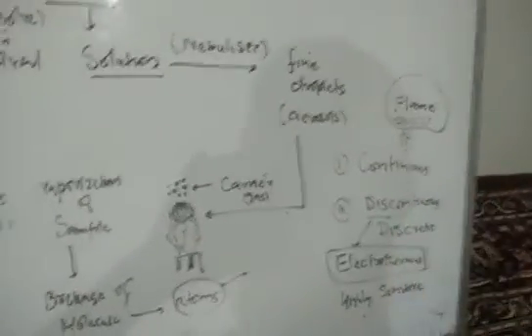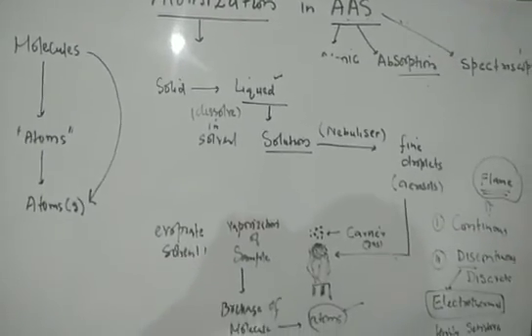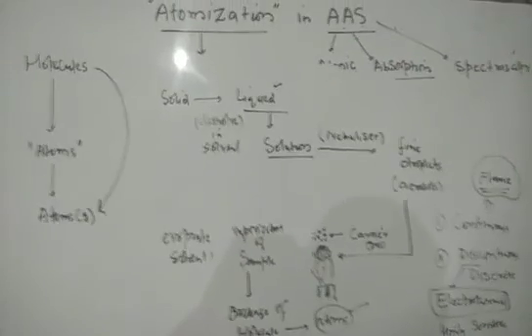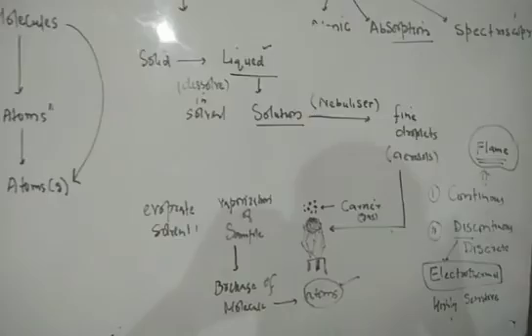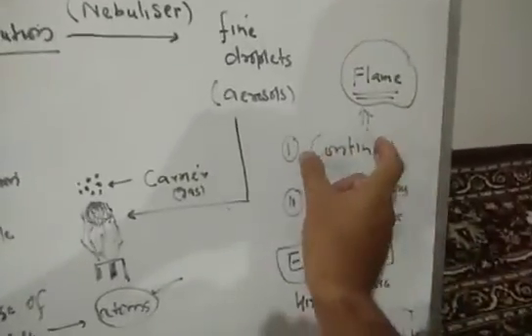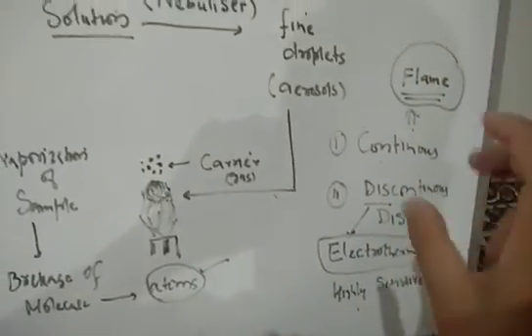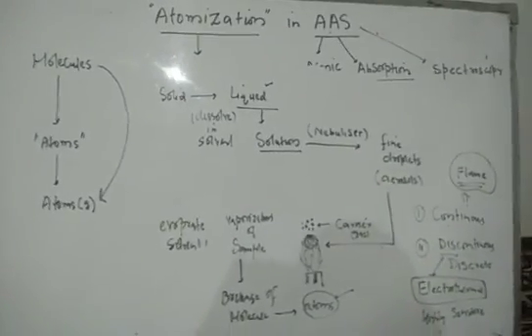It is more sensitive. तो ये हो गया हमारा basics about the crux of the atomization process and atomizers used in the atomic absorption spectroscopy. So this is all for the day. जो हमने basic information से extract की topic से. तो next we'll discuss these. The next class this जो continuous इसके main points क्या आते हैं continuous में, यानी flame में, और electrothermal atomization processes में जो main points क्या है. So this is enough in this topic as far as your objective exam is concerned.